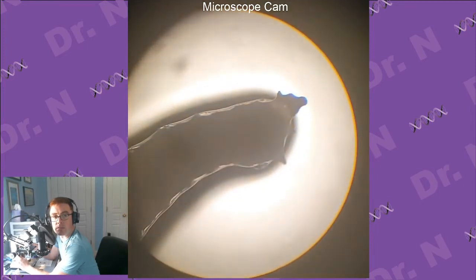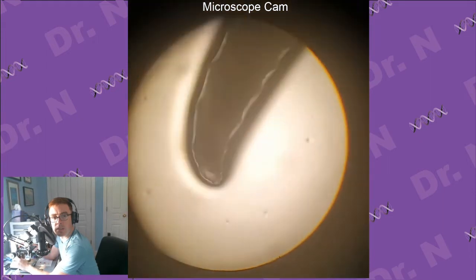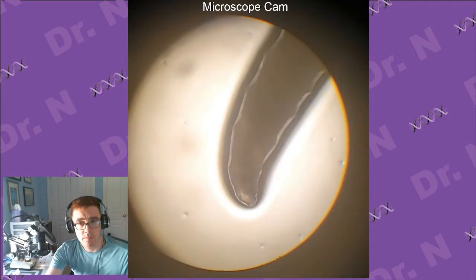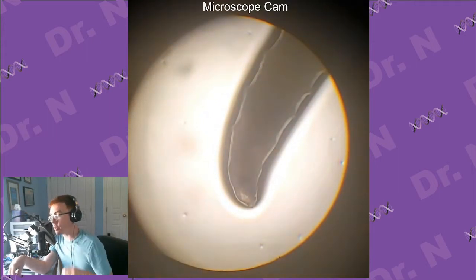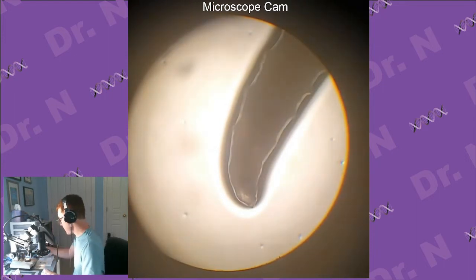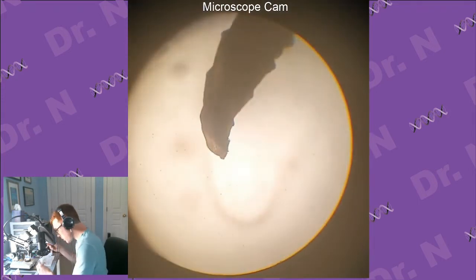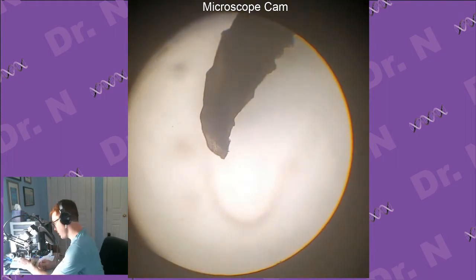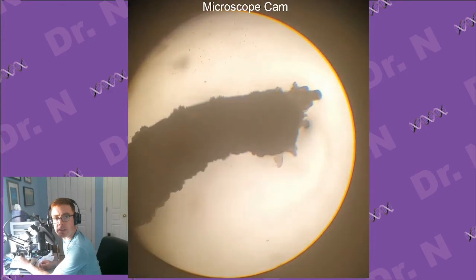My camera is trying to autofocus, which is not helpful. So the plan is to use these guys, and it might take a couple attempts. I'm not actually sure how well I'll be able to do this regardless. Oh, he's drying out. So these are in 100% ethanol. There. Actually, that cleared it up a little bit too. Yeah, these are in ethanol, so they might dry out a little bit when I add this rehydrating buffer to them. It looks like something happened.